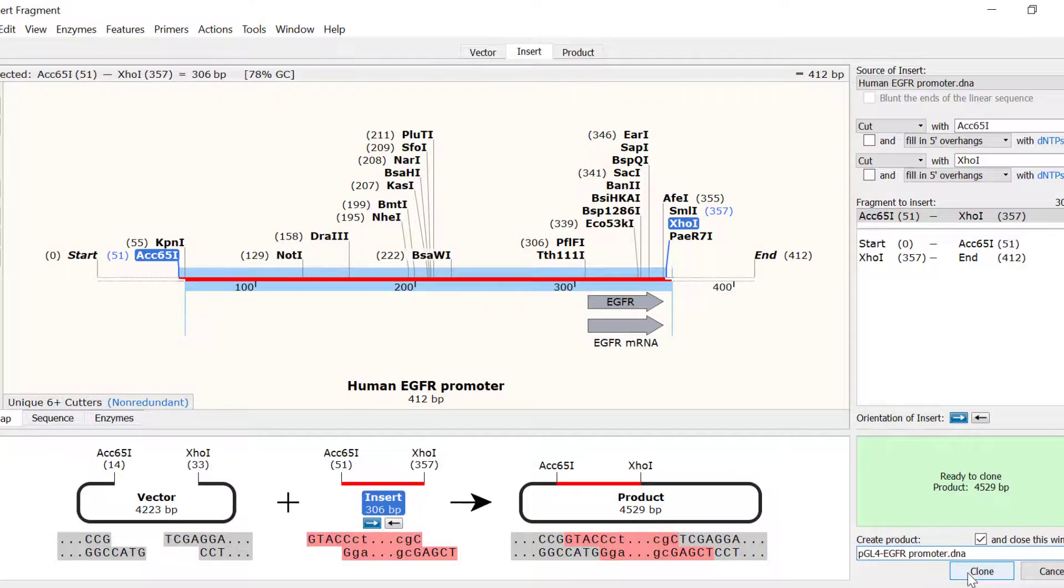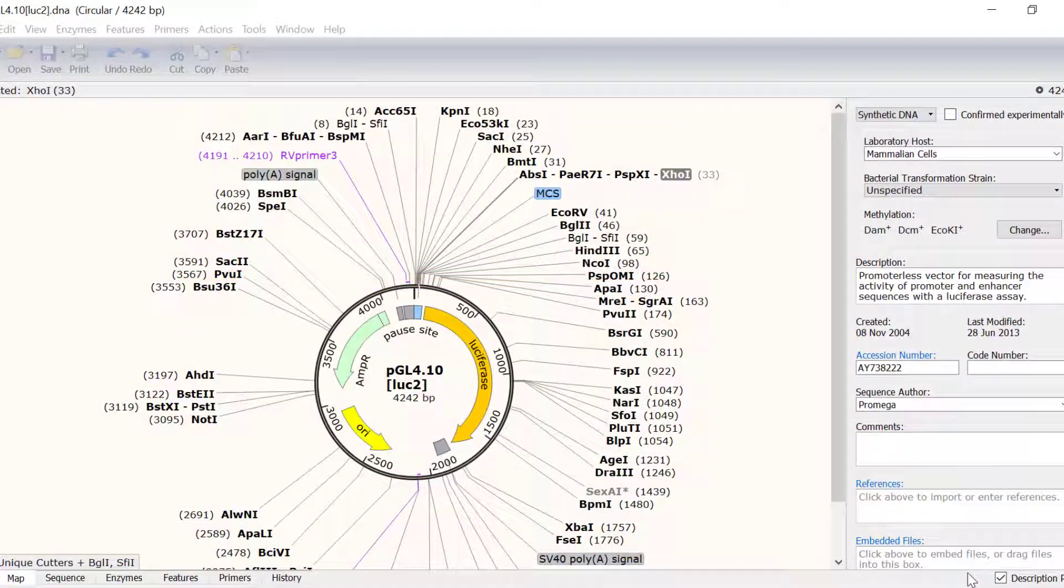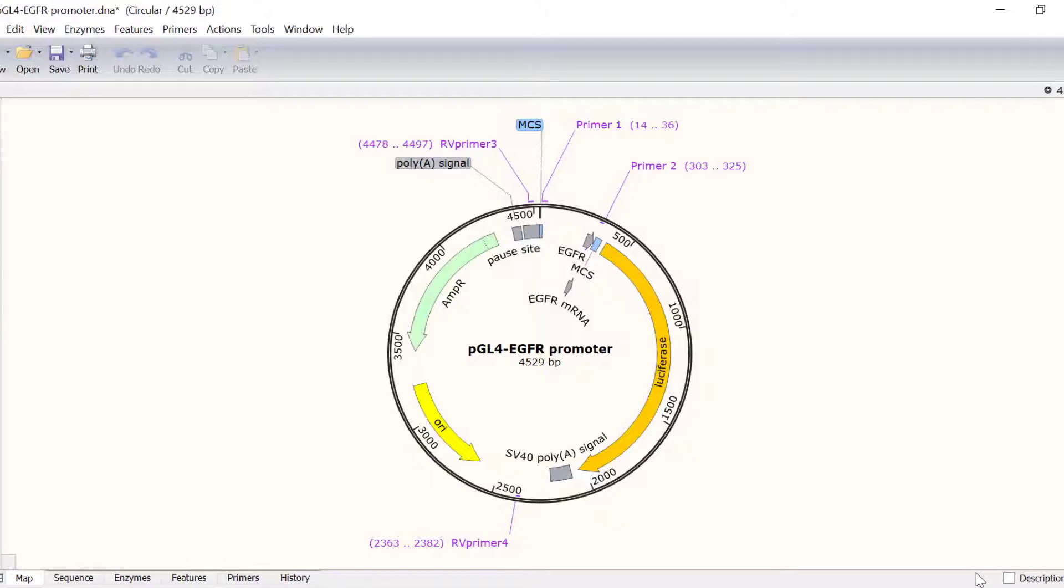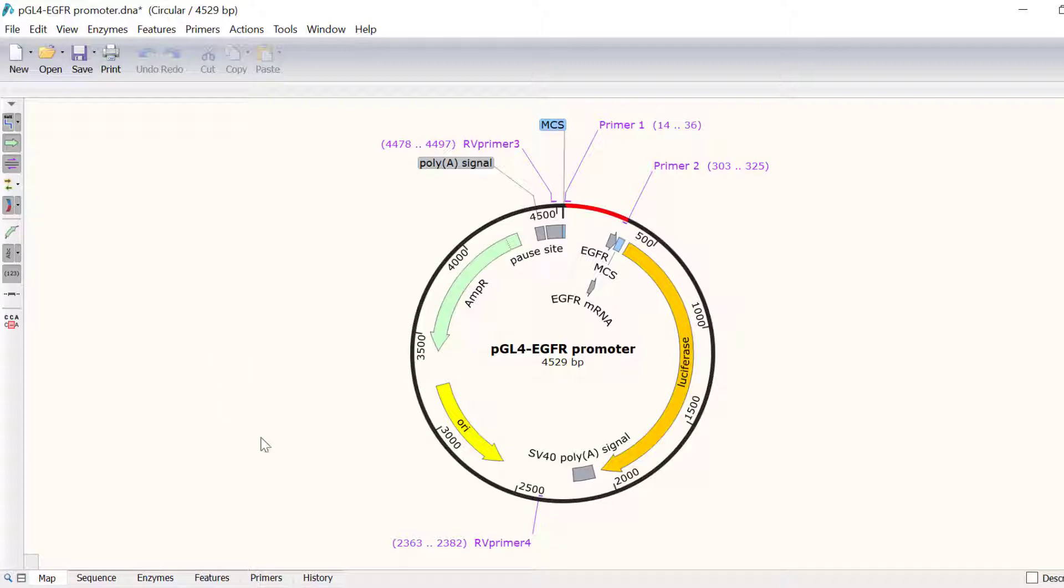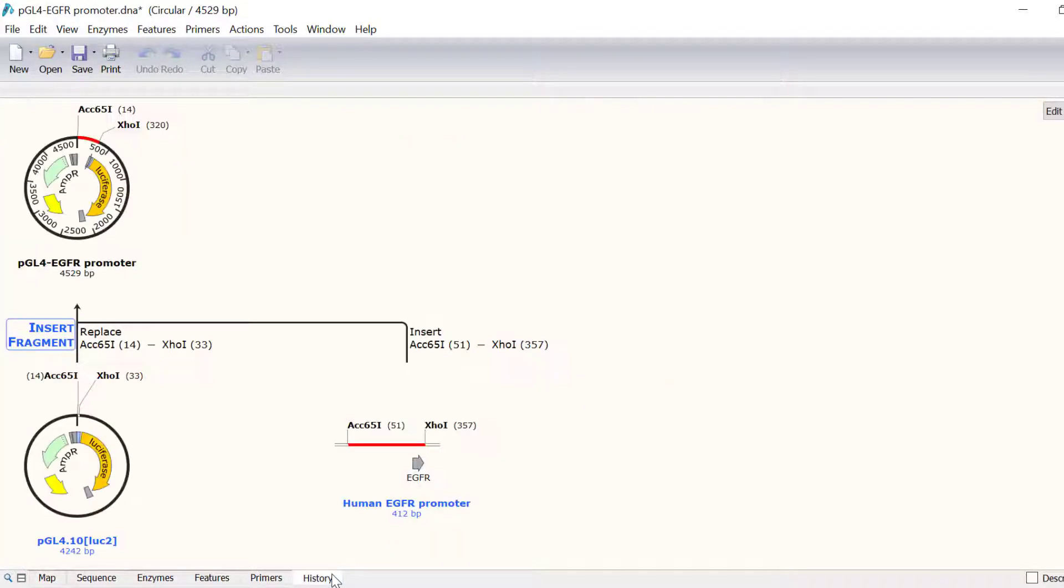In the map view, you can select the show colours button to view the history colours as before. Also, if you go on the history tab, you can see a schematic flowchart of the operations previously performed.